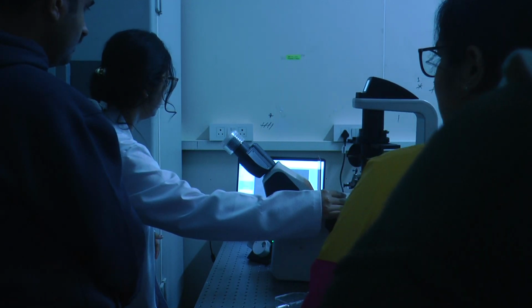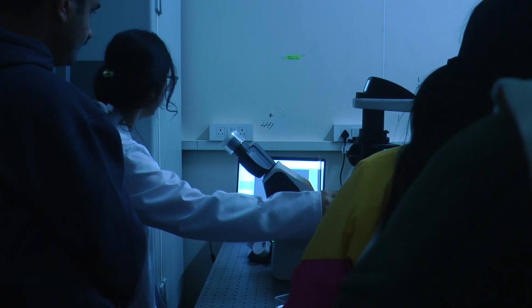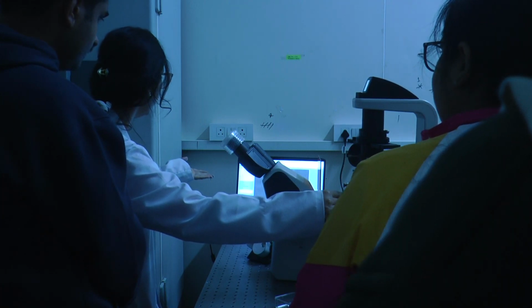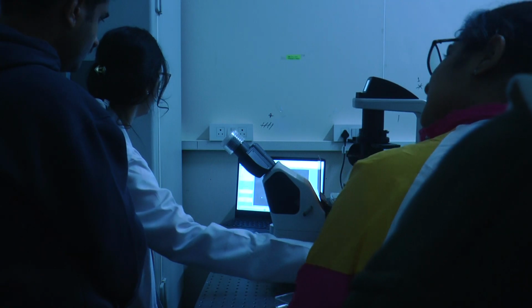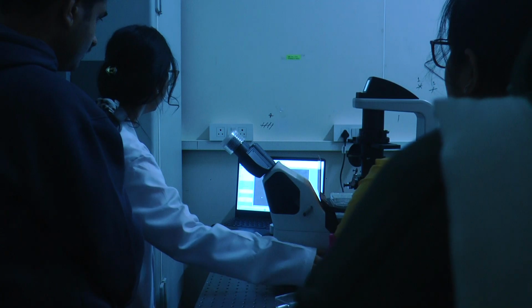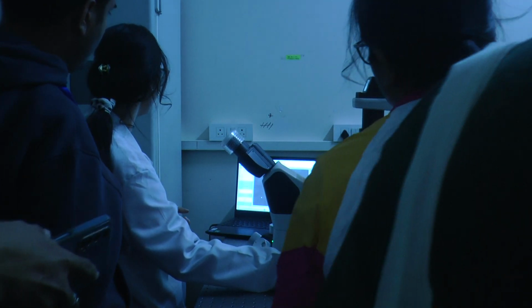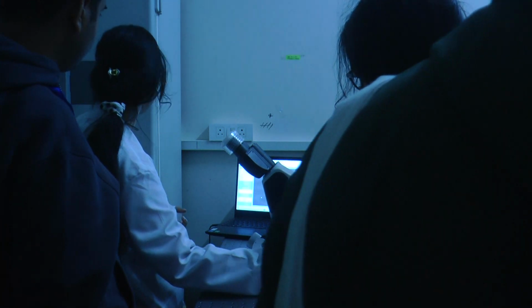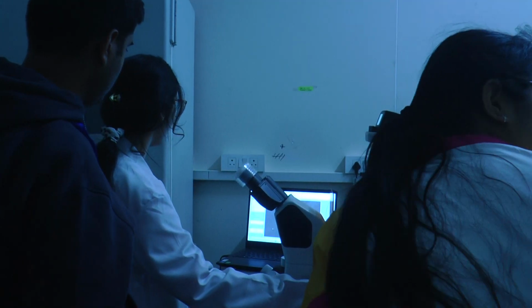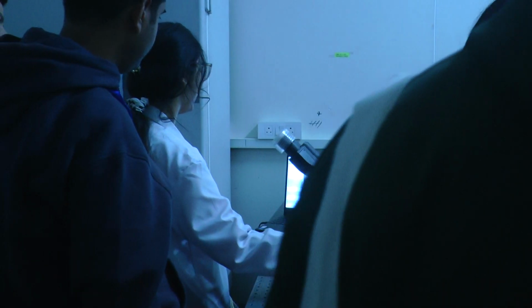Especially when the concentration is like 1.5, 1, above 1, it starts vesiculating. Like now we had this for 1 hour. So you have to give it more time for that. Like I usually keep 1.5 to 2 hours. Let's look at these structures. In 1.5 hours, each of these cell membranes will come out. Yeah, most of it. How much they can come out again depends on time, how much you will keep.